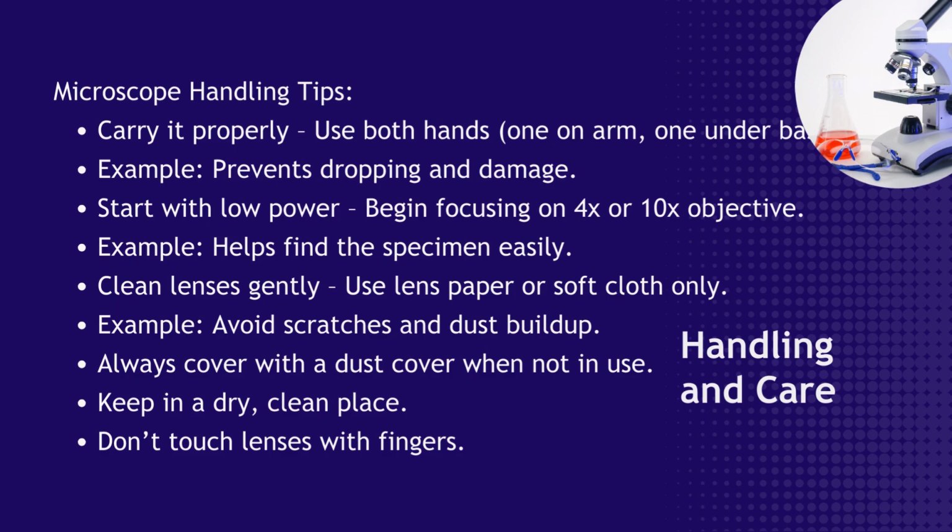Clean lenses gently, use lens paper or soft cloth only. Example, avoid scratches and dust build-up. Always cover with a dust cover when not in use. Keep in a dry, clean place. Don't touch lenses with fingers.